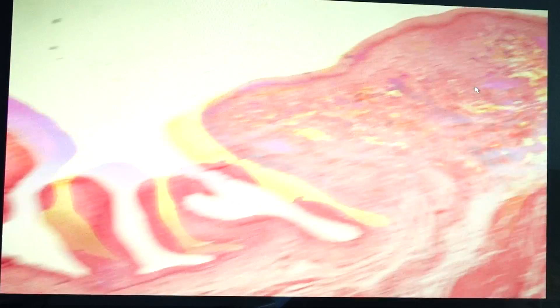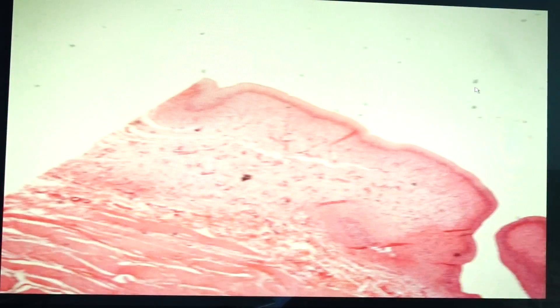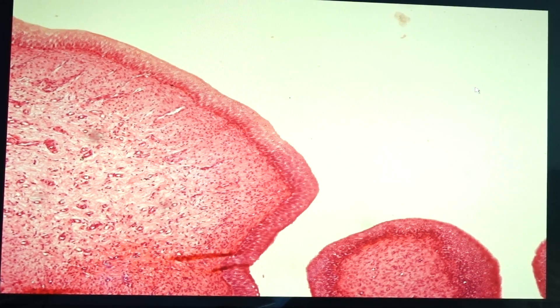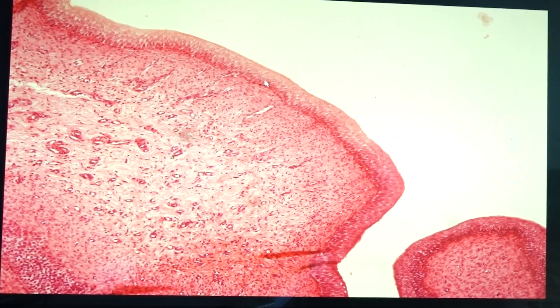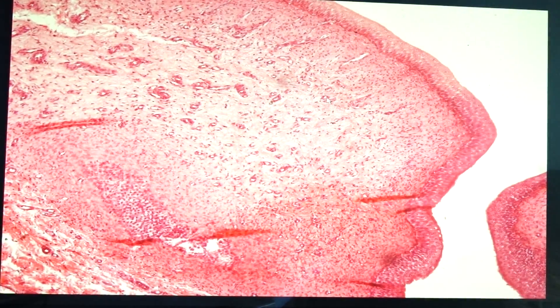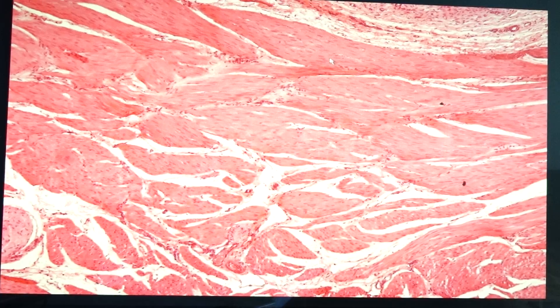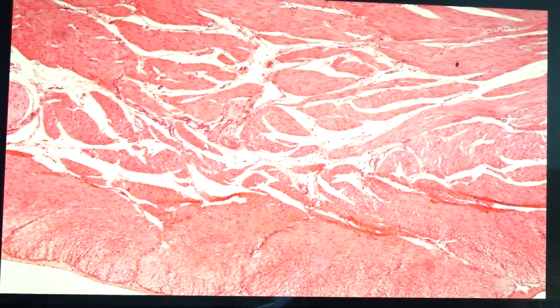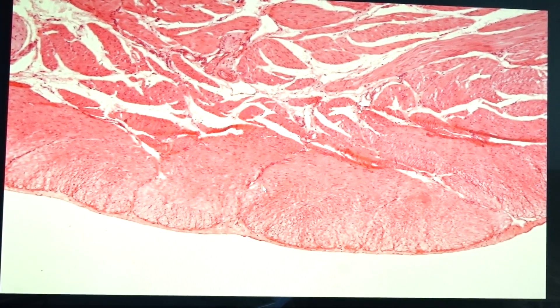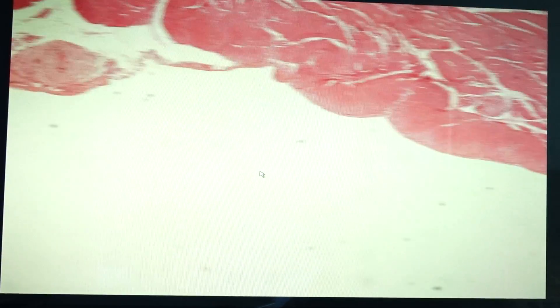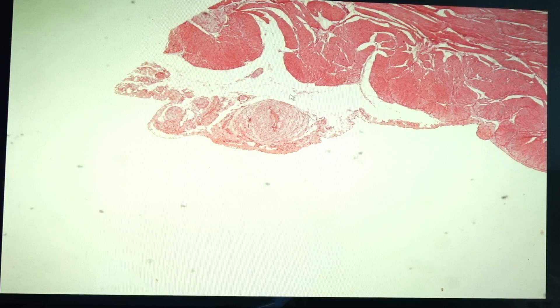Our last slide for today would be the urinary bladder. The urinary bladder is flattened — this is a cross-section of a big organ so you would expect to see a little bit of a flattened area. This would be the lining epithelium, which is a transitional epithelium. You have the connective tissue, and then underneath in the middle layer you have the muscularis, which is composed of an inner longitudinal, a circular, and then another outer longitudinal layer. This one is the adventitia, and the outer covering would be the serosa, which would be exposed to the peritoneal cavity.